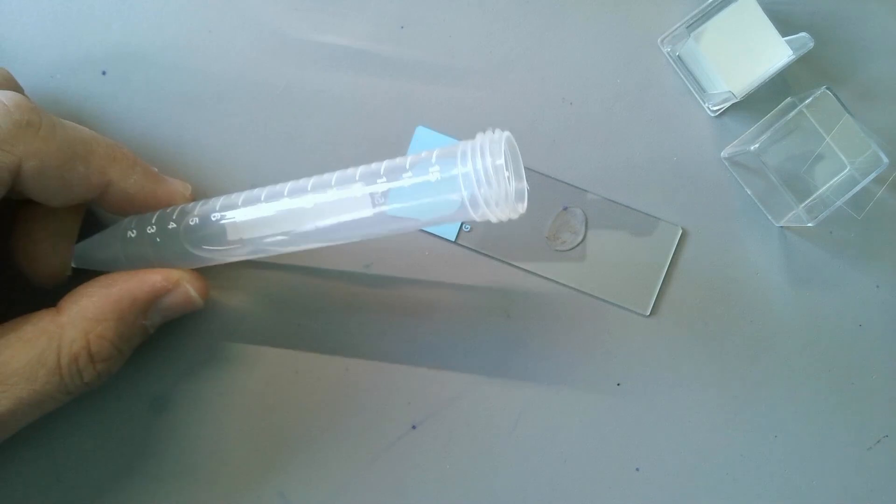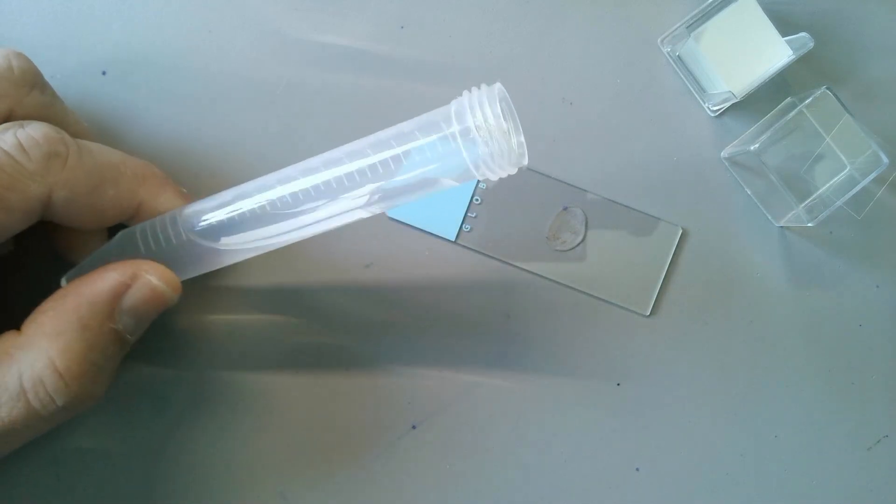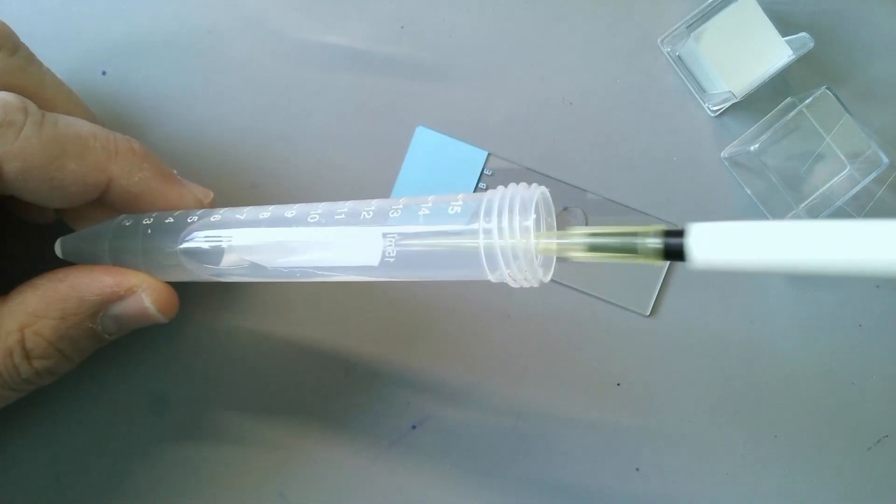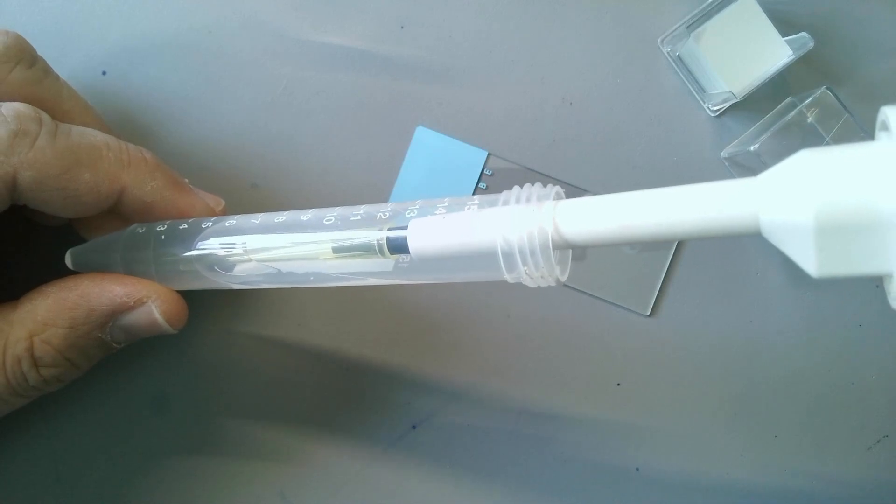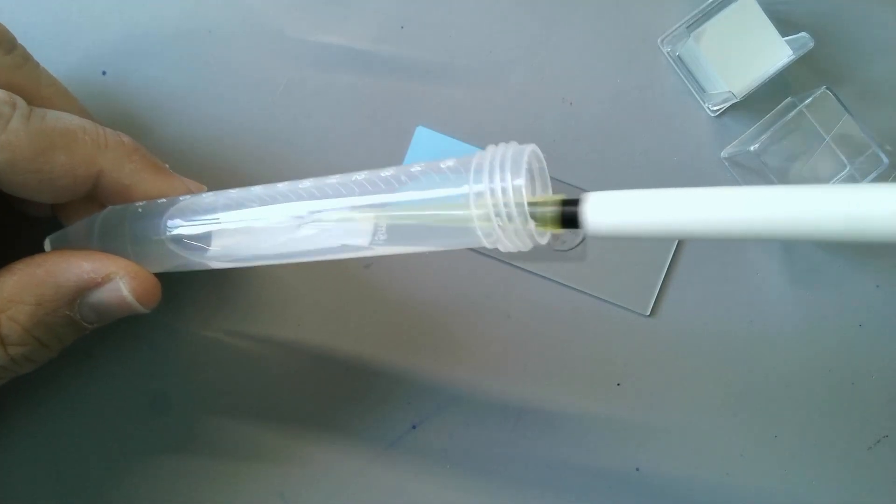Now, the second method is a little bit slightly more advanced. And that's also a method that I like to use quite frequently. And that is you add a substance that is very thick, very viscous. Like for example, in this case, methyl cellulose, which you can quite easily make yourself.